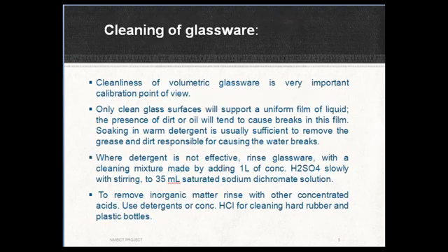Now let's try to understand the GLP for cleaning of glassware. Cleanliness of volumetric glassware is very important from a calibration point of view. Only clean glass surfaces will support a uniform film of liquid. The presence of dirt or oil will tend to cause breaks in the film. Soaking in warm detergent is usually sufficient to remove the grease and dirt responsible for causing the water breaks.